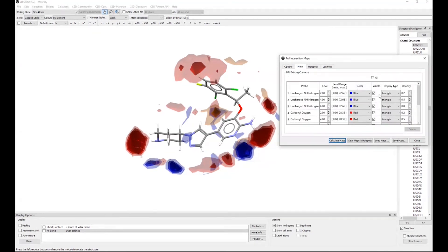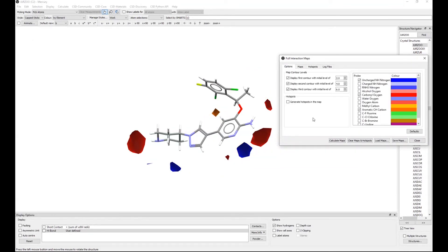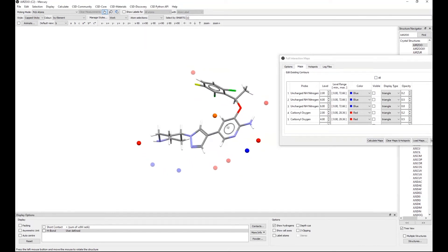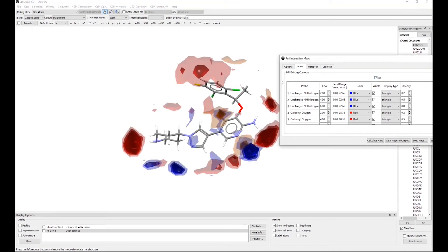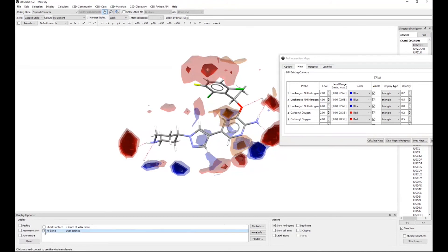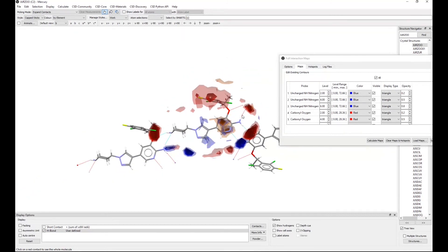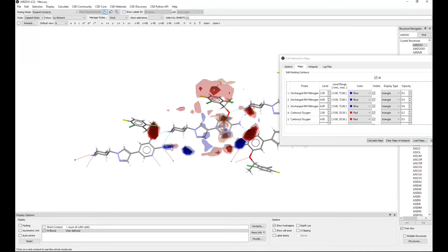I can control the contour levels shown from the second tab, unticking things to see only the most probable interactions. To generate hotspots and recalculate, I turn the maps off by unticking everything, and I get small points around the molecule — these are the hotspots, the areas of highest density in the full interaction maps. Turning maps and hydrogen bonding back on, you can see that the functional groups appear where expected, though not so much in one area.